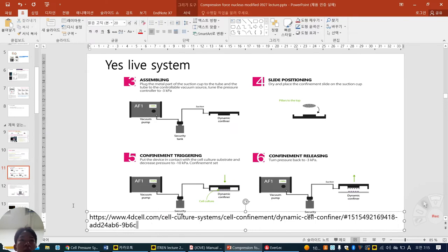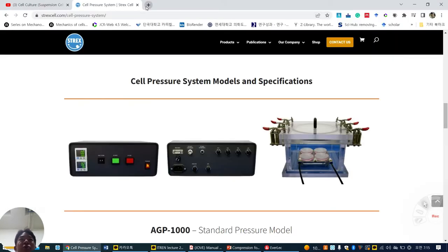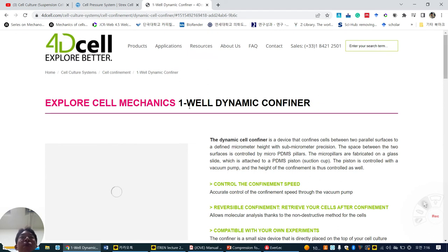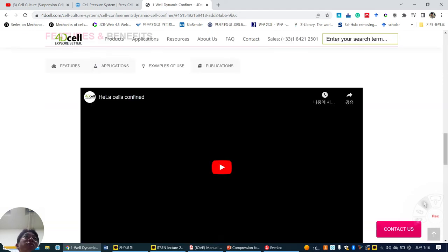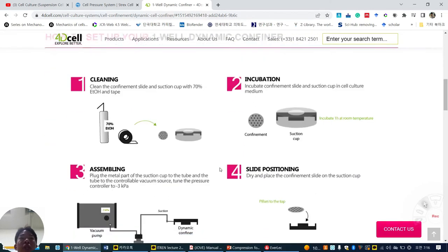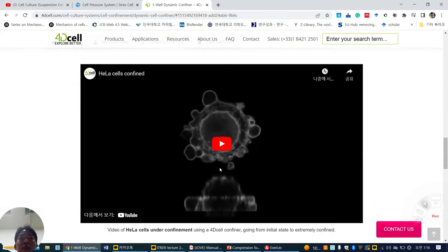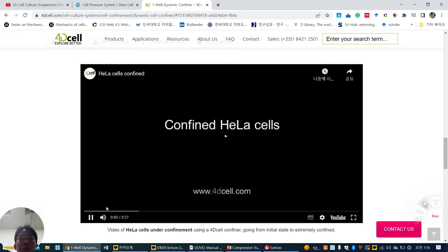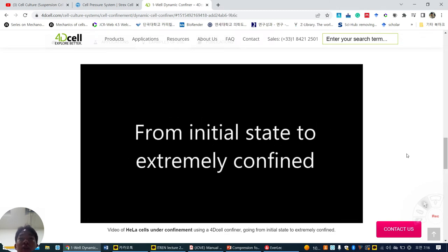Okay, and then when I visit this website, this is 4D Cell company. Actually, this is a startup company from the institute in France. So when you visit here, you can see more information about your system. So one of the videos shows how they utilize the confinement.